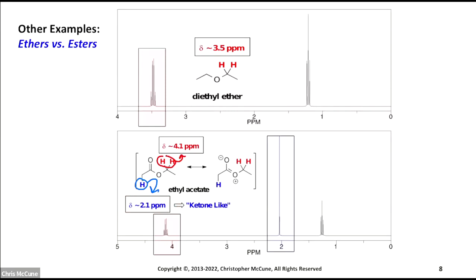It's hard to see on the screen, so let's go ahead: this is the ketone-like alpha H's, and this is the ester-like COC.